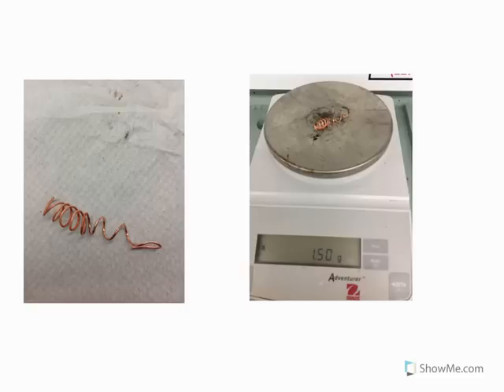You can then find the mass of the unreacted copper. Use acetone to help dry off the copper, there will be a beaker provided by your teacher, and then paper towel to dab it dry. Then we weigh and record the mass of the unreacted copper and dispose of the copper as directed by your teacher.